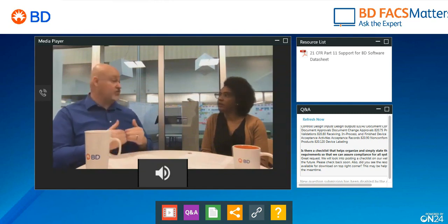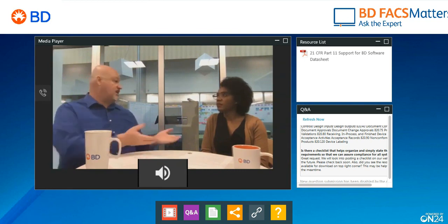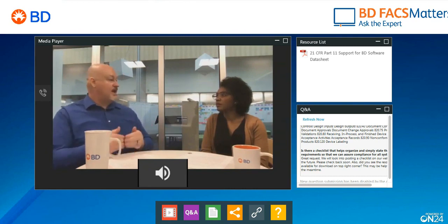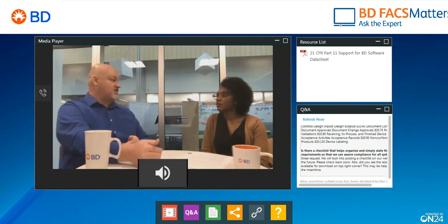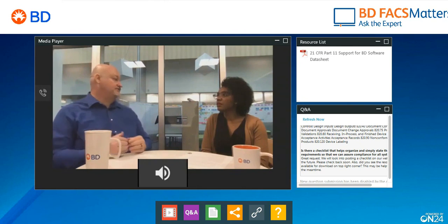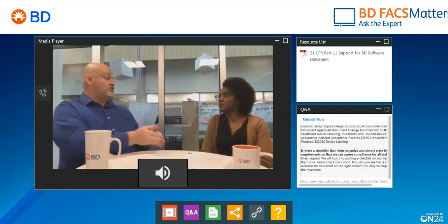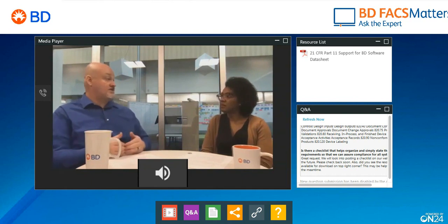It also talks about record retention. We have to know how long we have to maintain these records, because especially, say, in the diagnostics industry, such as you're in, a lot of times we have to maintain that information for a period of time, because it can be required to go back to maybe 5 years later. Does it say what that time frame is? So again, you would go to the predicate rule to determine what that time frame is.